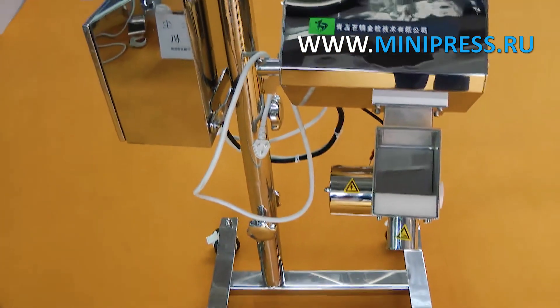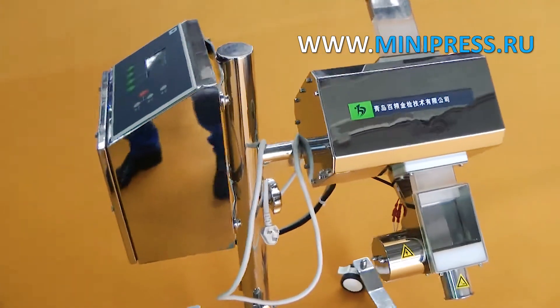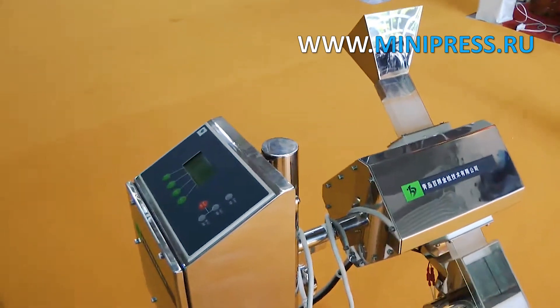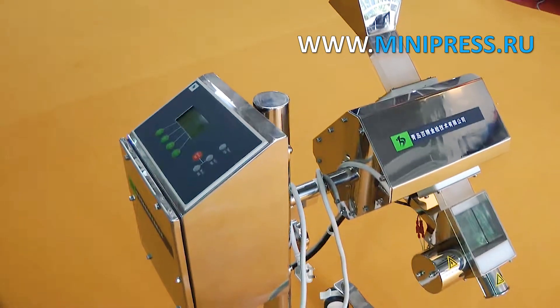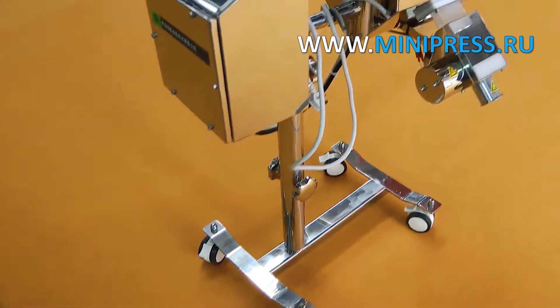Minipress company experienced specialists will help you to choose the right model of equipment. Our catalog Minipress.ru is one of the most respected in the pharmaceutical industry. A daily consultant answers questions in WhatsApp. We're proud to offer professional advice on choosing any pharmaceutical equipment.